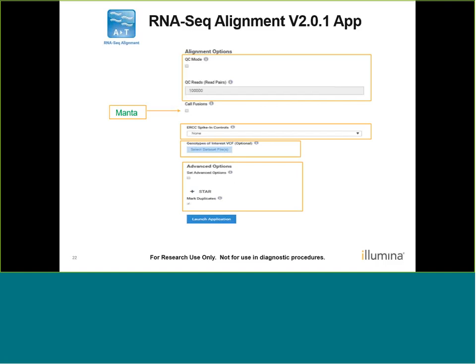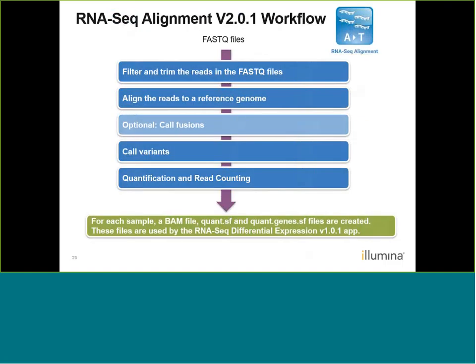Lastly, for the advanced options, you do have the ability to modify these options. However, if you're new to this, we recommend running it with all of the default options. And then you're going to launch the app. So behind the scenes of the app, this is what's actually occurring. We are going to perform these different steps in the workflow.